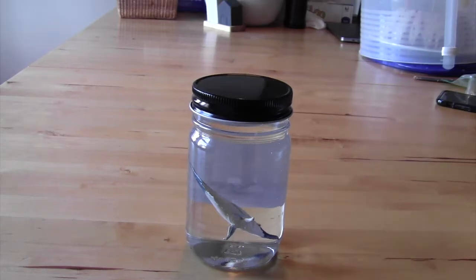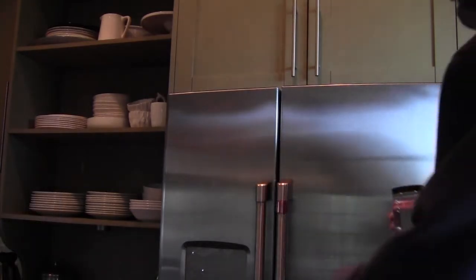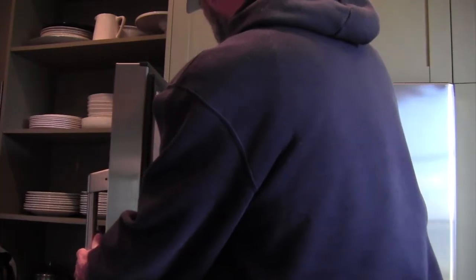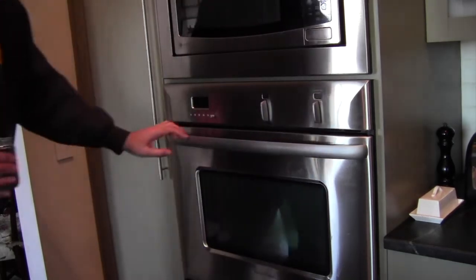This sample will be the 20-degree sample, so we can just let it sit at room temperature. For the 10-degree sample, we'll put it into a cold environment. And the warmer sample can go in the incubator.